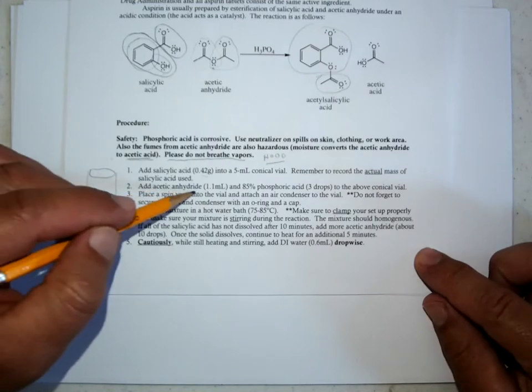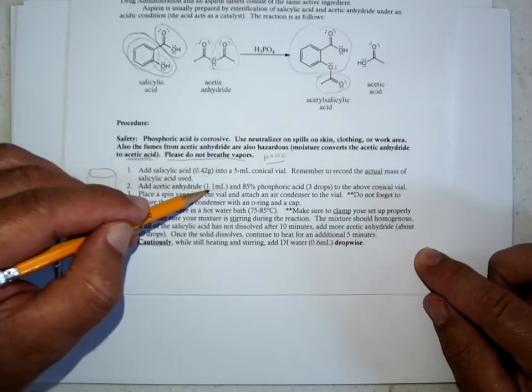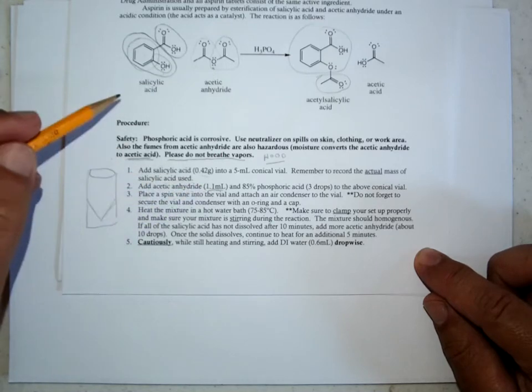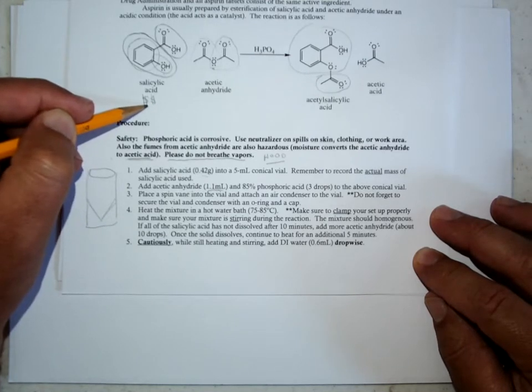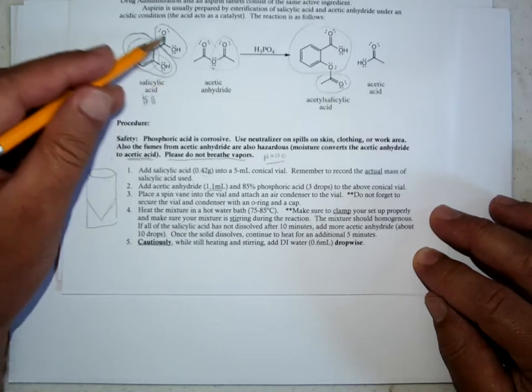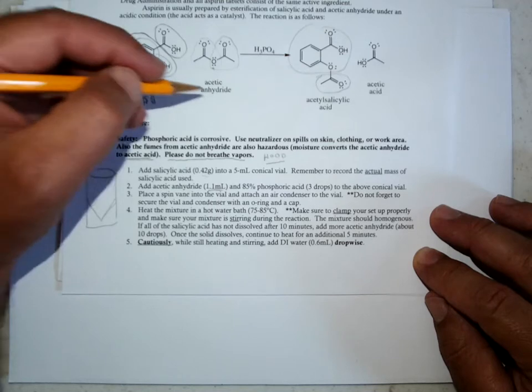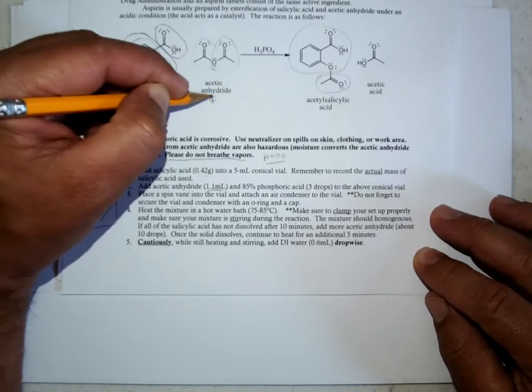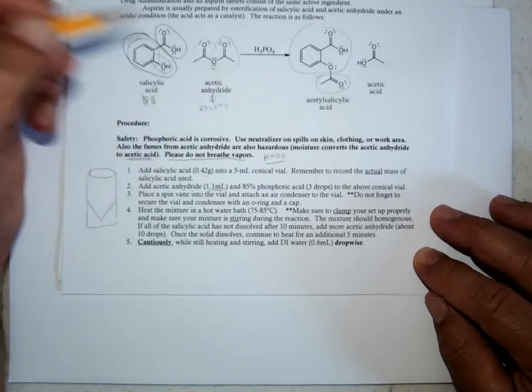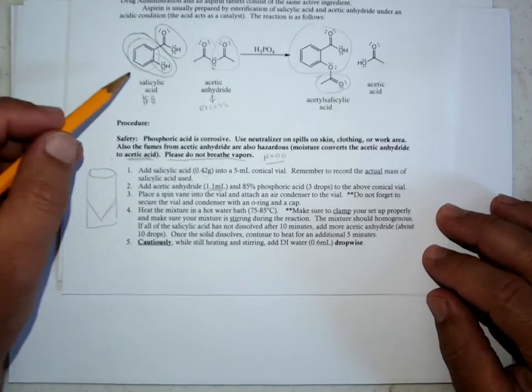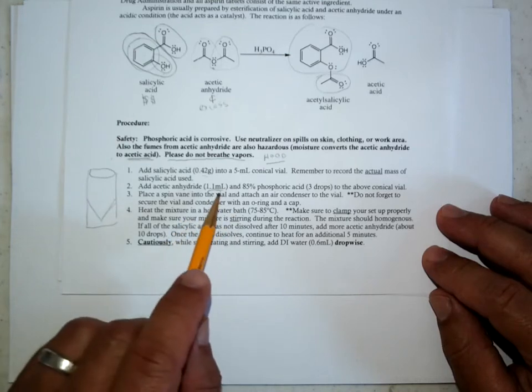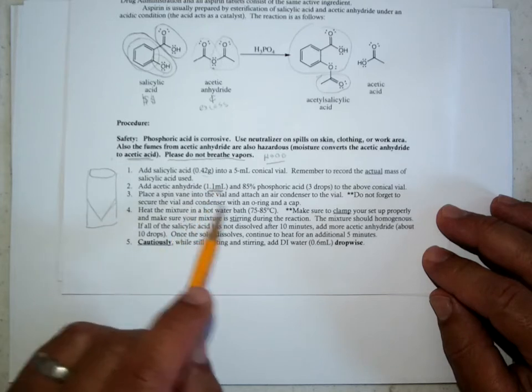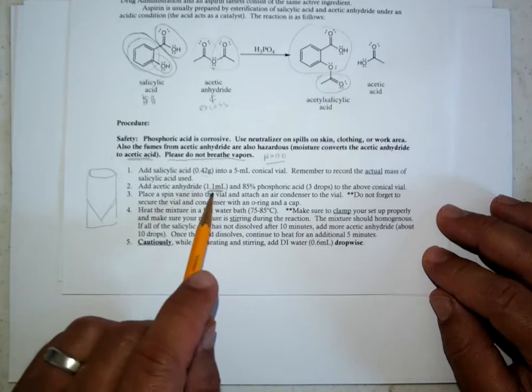However, you add acetic anhydride, and the 1.1 milliliters makes this in excess, so the excess reagent. Oftentimes you're going to have an expensive, difficult-to-get compound that you're going to make the limiting reagent so that you can get as much of this converted as possible. And this guy is much cheaper, so you're going to use an excess of this to drive the reaction forward and to give you as much valuable product as you can for the least money. So there's a lot of very practical aspects to this. Also, if you have an excess reagent, it does, in addition to driving the reaction more to completion, we don't have to weigh this as accurately as if it's in excess.